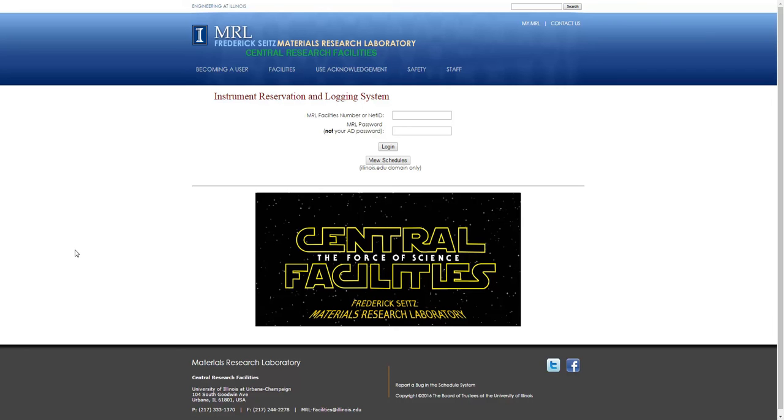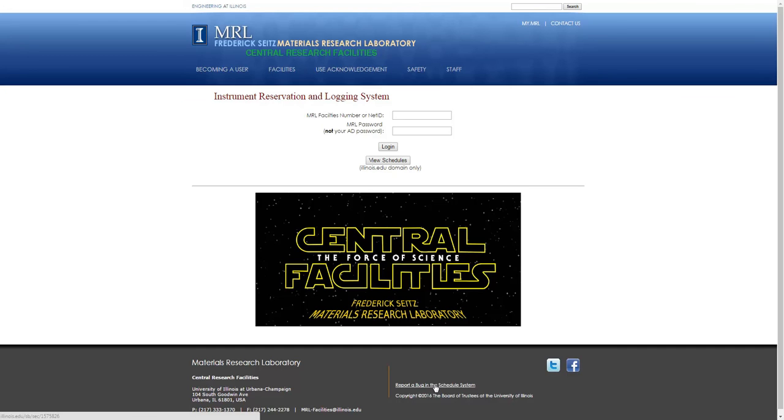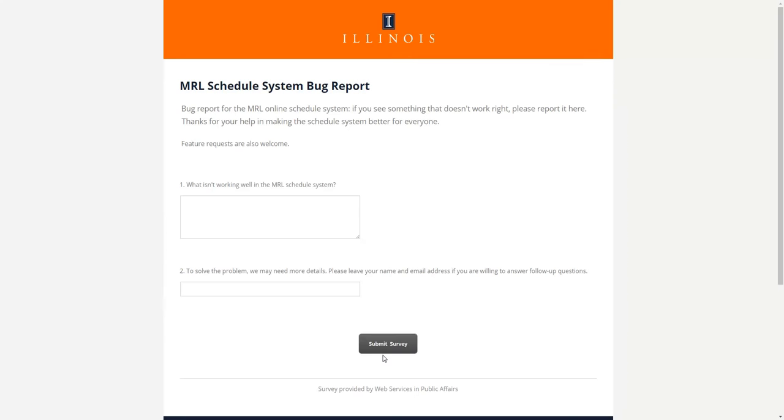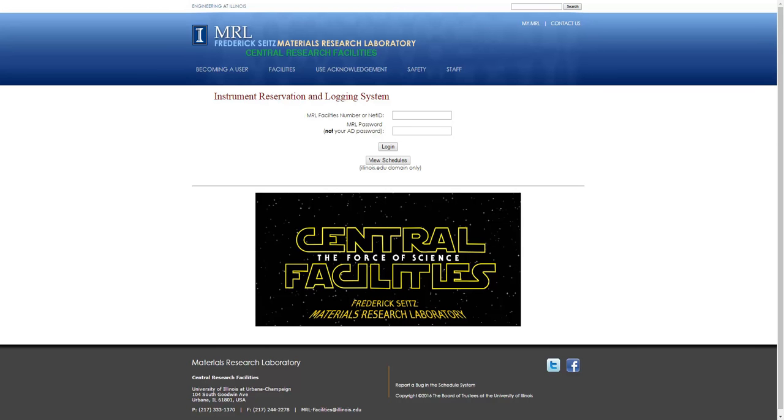Welcome to the MRL Schedule System. At the top of the page are a list of useful links, and at the bottom of the page is a link to where you can report any suboptimalities in the Schedule System.